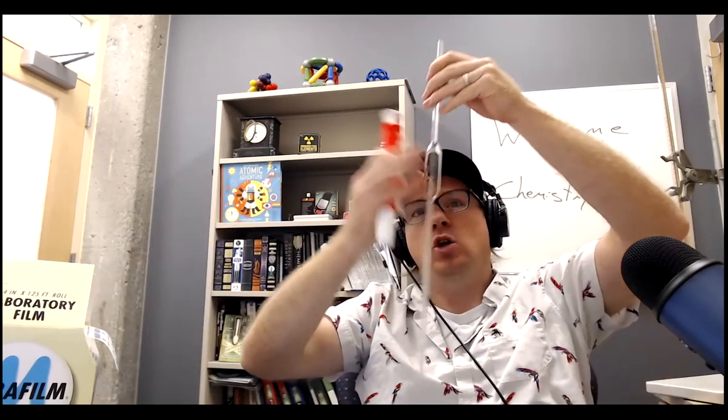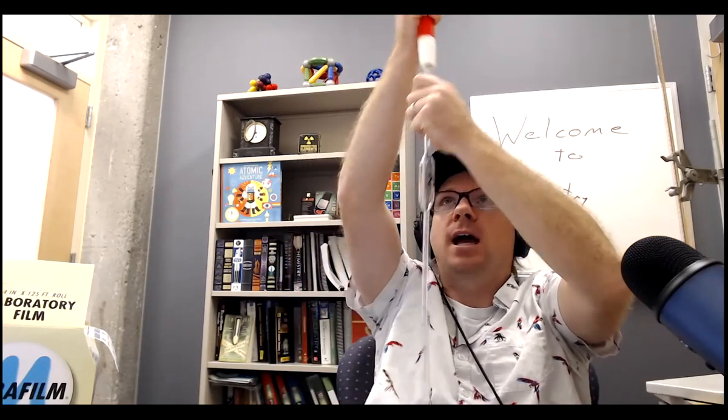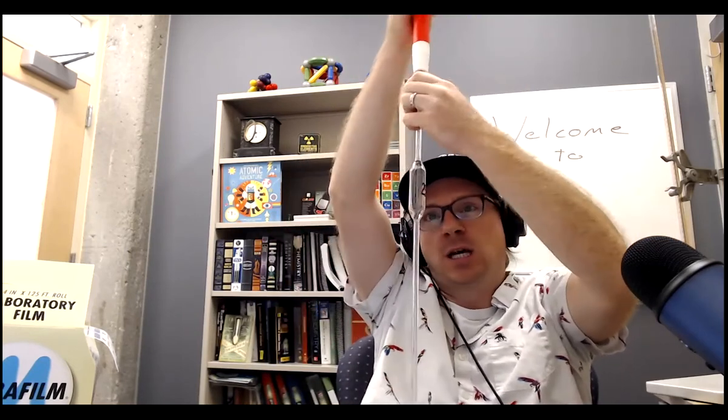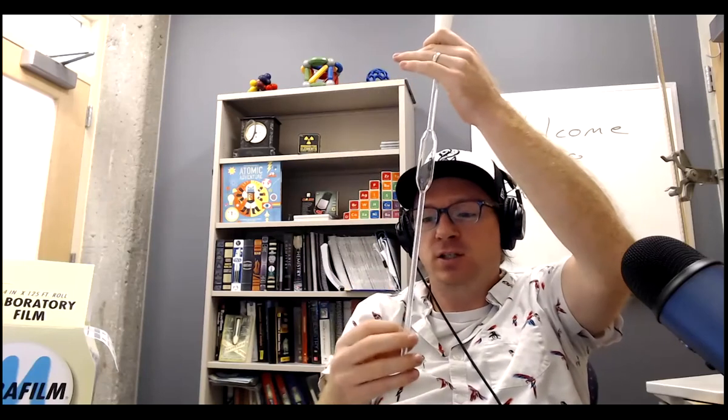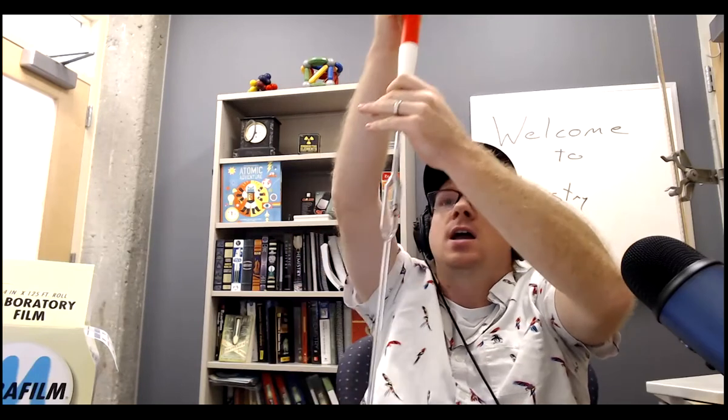Actually, it doesn't need to be dry. You're going to add a bunch of water to it anyway. So a clean beaker. And this is a really good way to start. You might want to rinse all your beakers with DI water. It'll be okay. This part you want to rinse with your iron solution. Now you're ready. You've rinsed it once, could rinse it twice. Definitely don't use a whole 25 mils to rinse. Then you won't have enough to do your 3 trials. So that's why you only pull up a little bit to do a rinse.